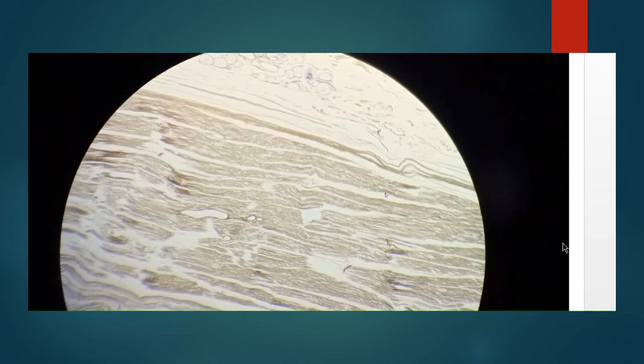Moving to the next slide, on the screen you can see some black and white tissue. What is this black and white tissue? In the black and white, we can identify only three things: compact bone TS, compact bone LS, and the next one is your peripheral nerve.